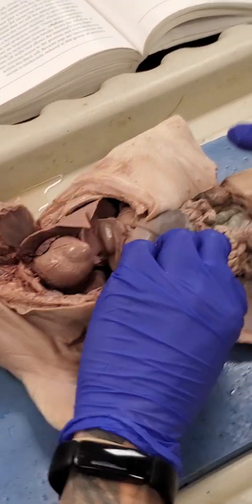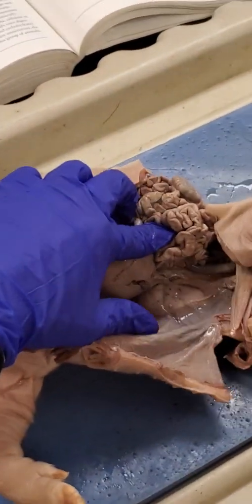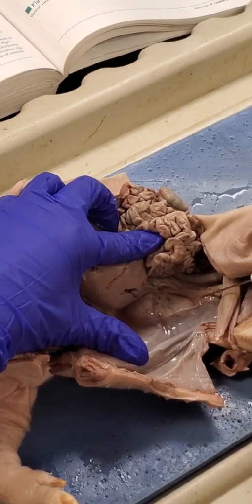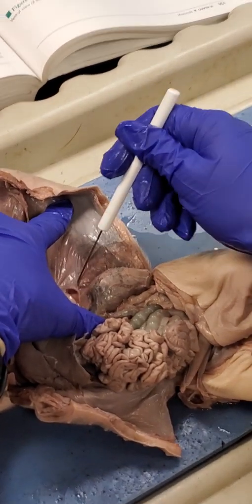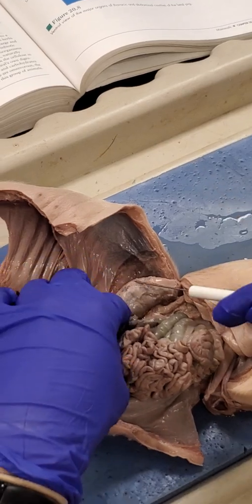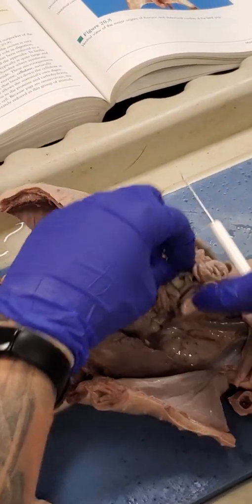So then our kidneys. Something neat about the kidneys is right here. You guys see this connective tissue? When it's fresh and you're cutting it open, it really kind of hides it. But on the other side, I had to cut it out. So see how I actually cut it out from the wall? And so it's right here, but it's really connected by a lot of tissue to the abdominal wall. So it's just that white stuff.